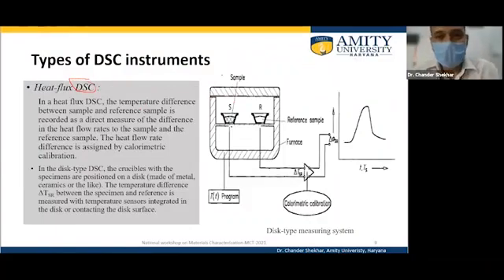the definition of a DSC we have given is that we measure the thermal energy flow. So thermal energy and temperature difference. In the DSC, there is a transfer function, there is a calibration. If you look at the image here, there is a calibration of the instrument that correlates the temperature difference.